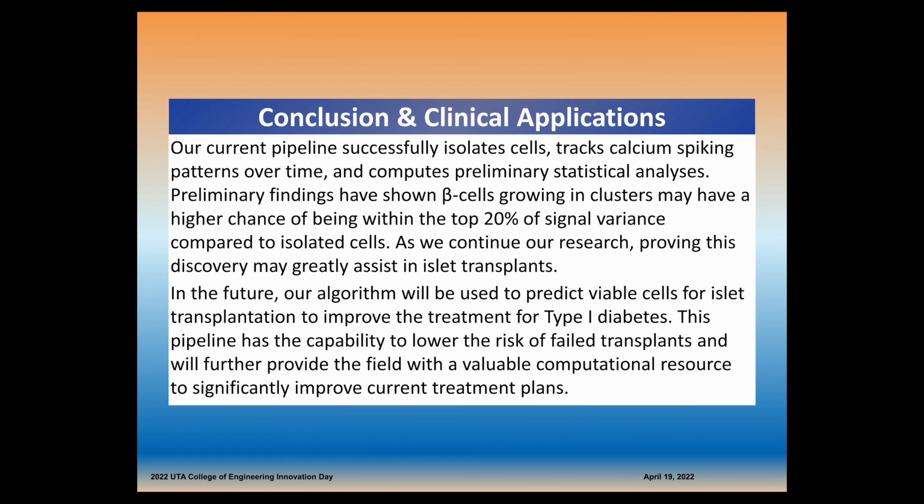Our future plans will include packaging all automated steps into one environment with all necessary packages preloaded. This will make distribution of the script very simple and require very little troubleshooting from researchers. We will also plan to use our pipeline to predict viable cells for islet transplants to treat type 1 diabetes by identifying appropriate calcium signaling patterns.